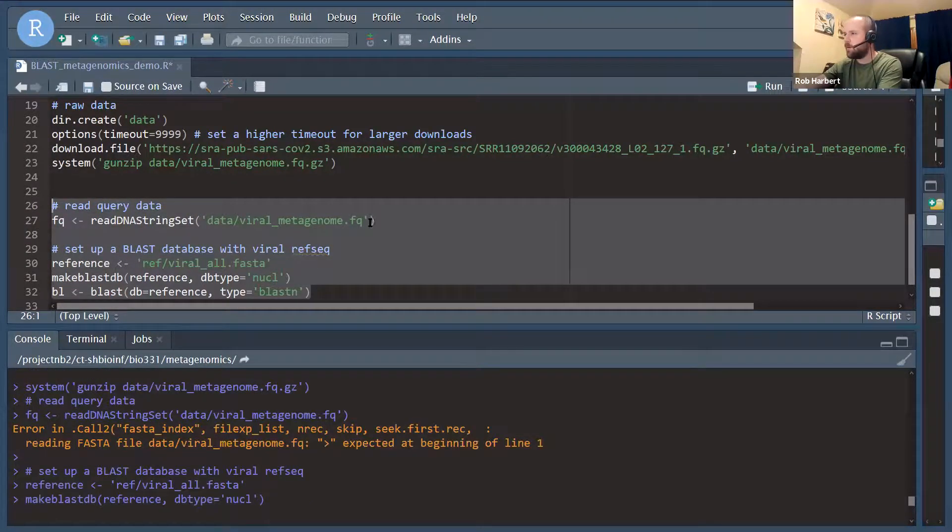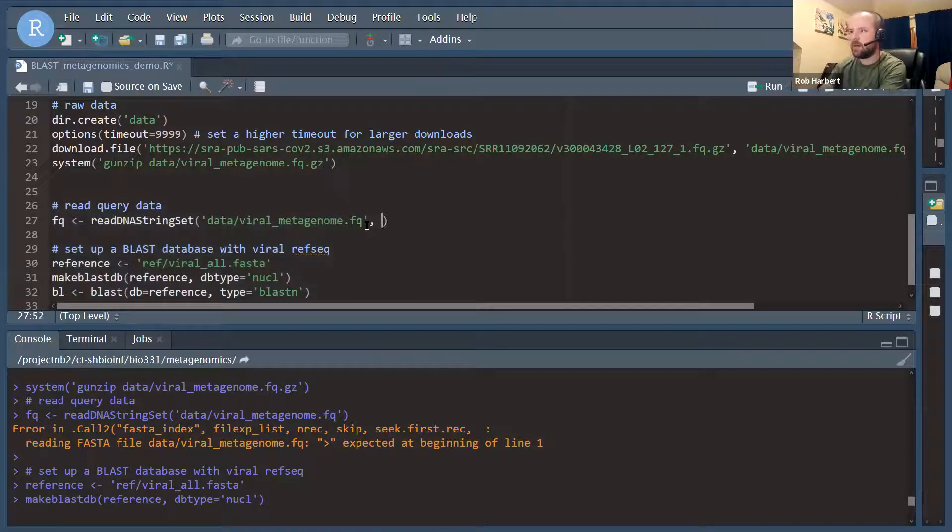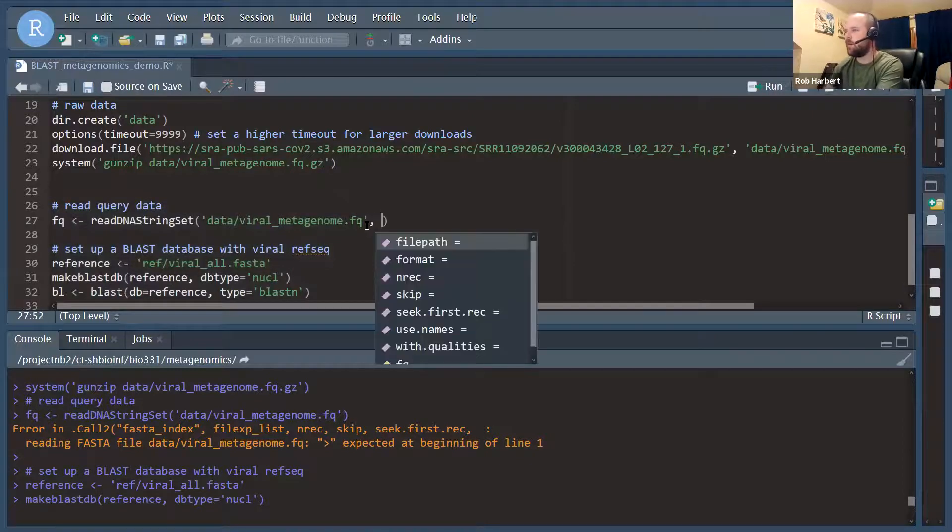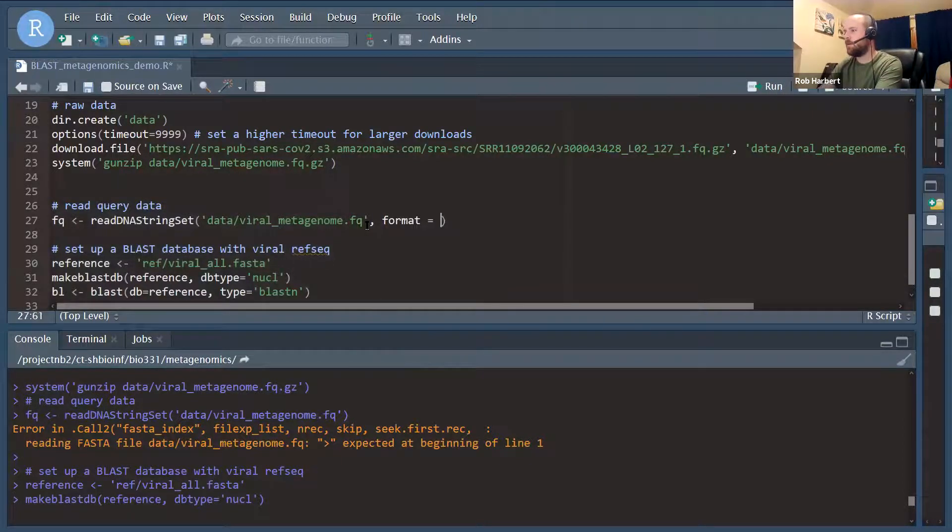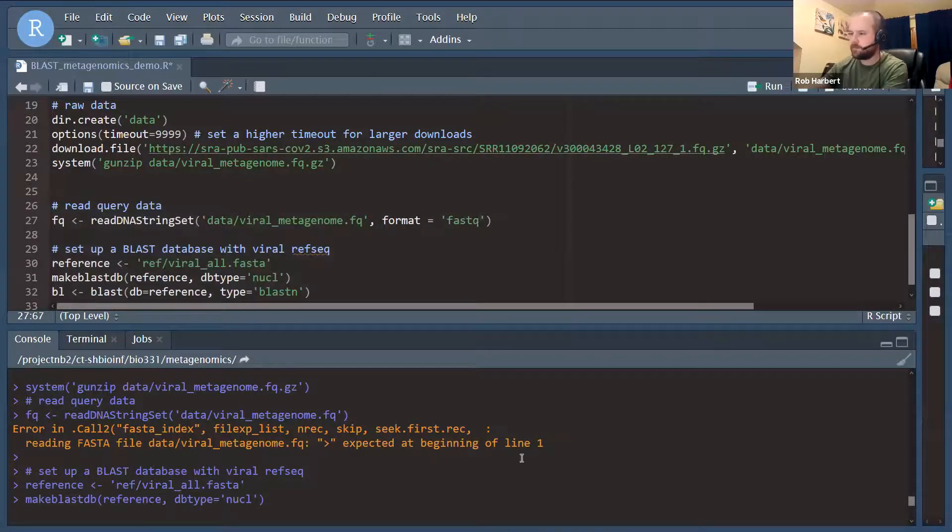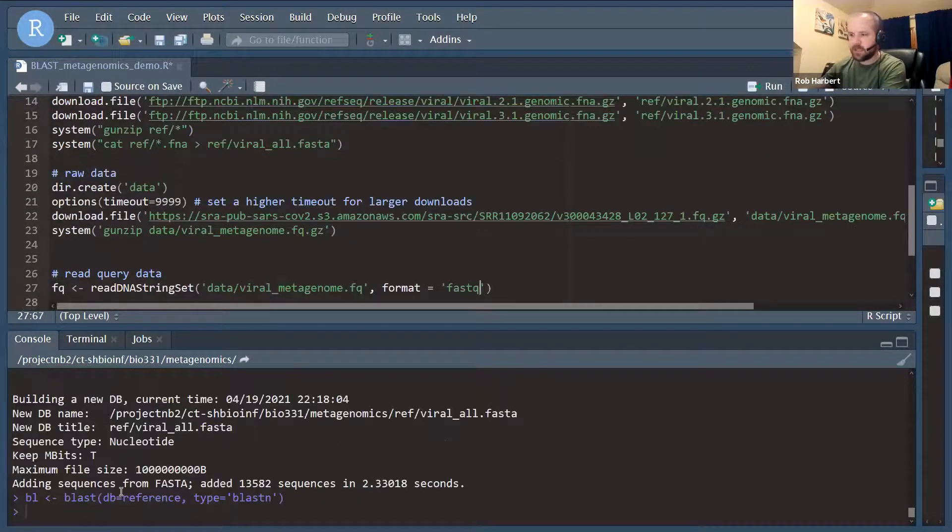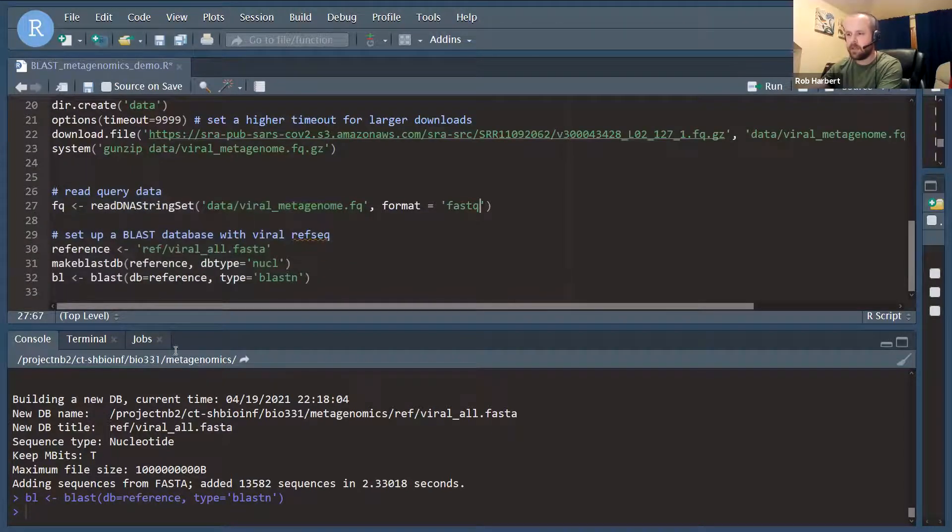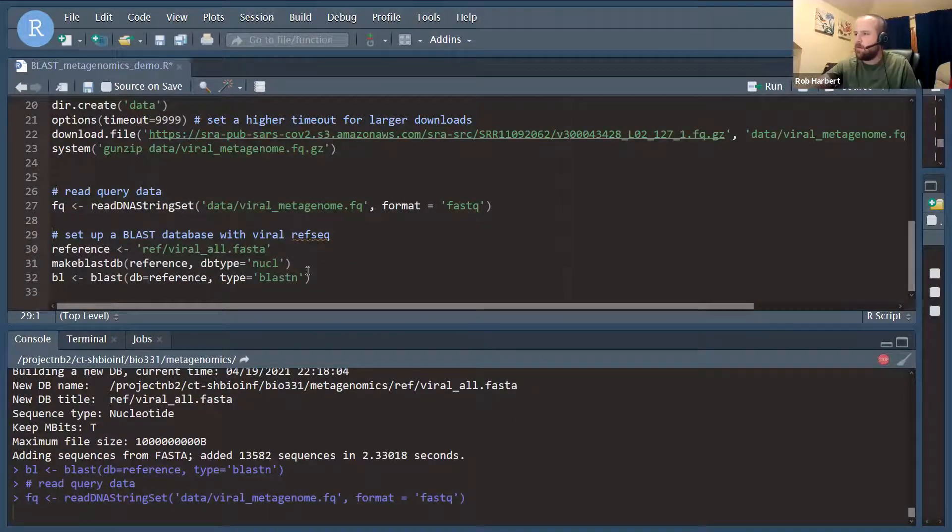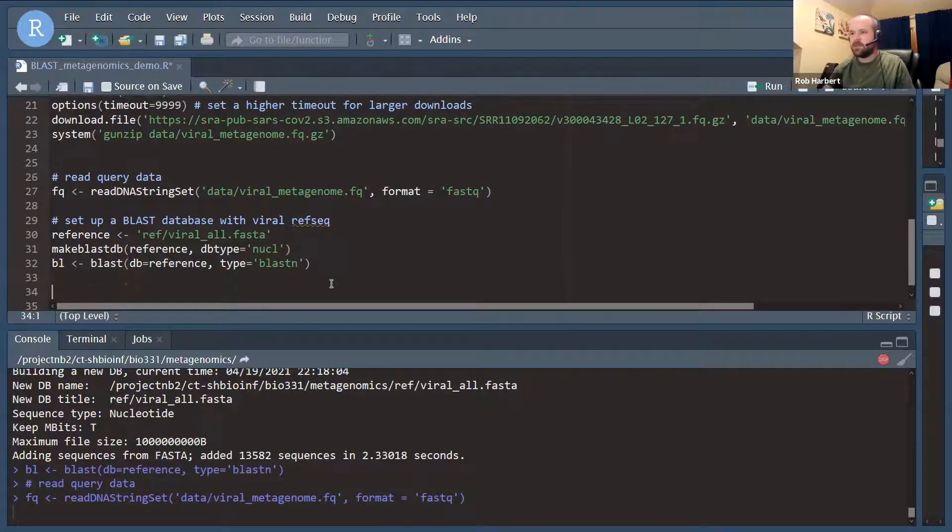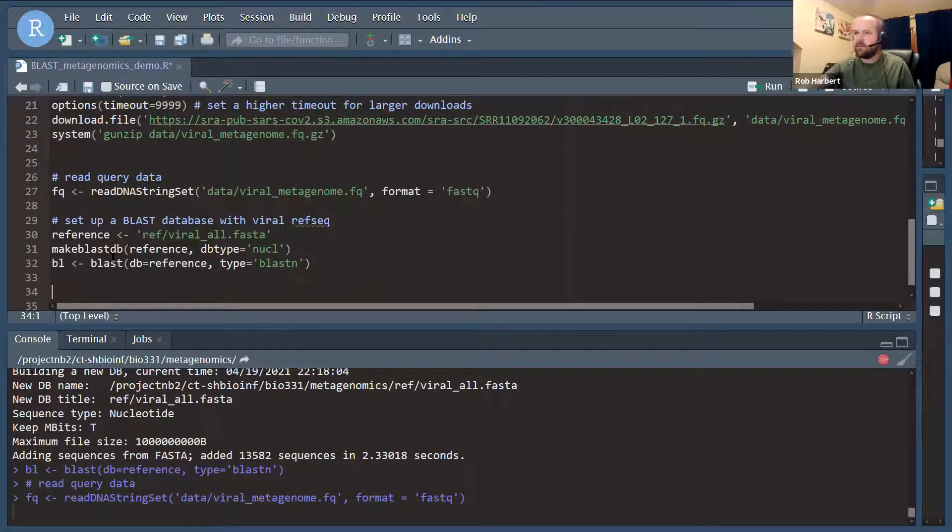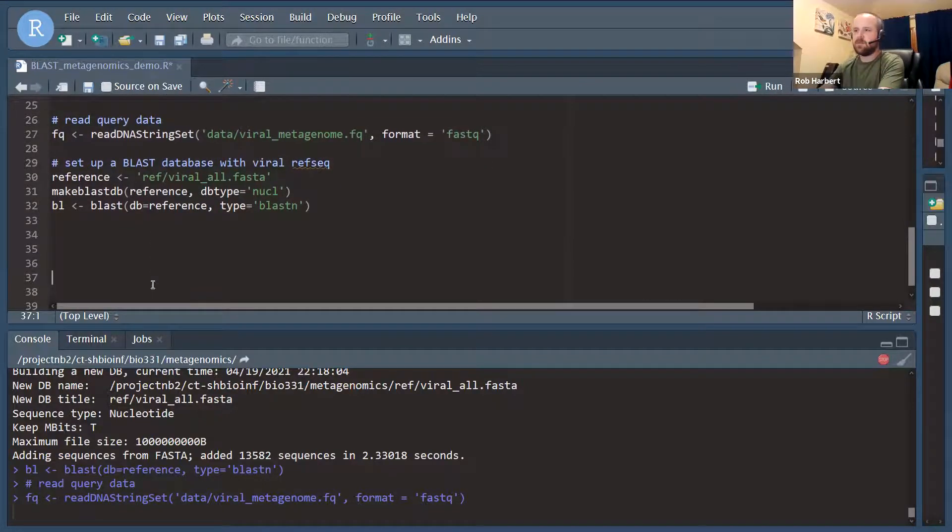Oh yeah, I made a mistake up here. Our format needs to equal FastQ in order to read FastQ data. So it looks like the BLAST database was built appropriately. That is the output we like to see. While that's reading, we'll want to take a look at that data object that we get in FQ a little bit once it's read.